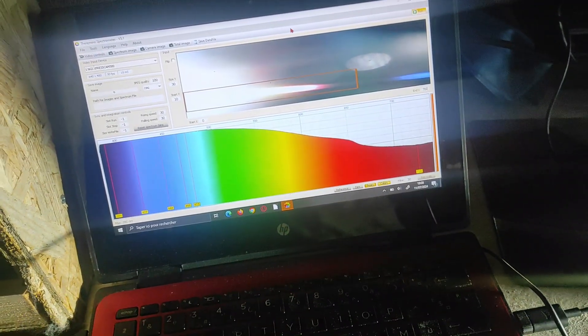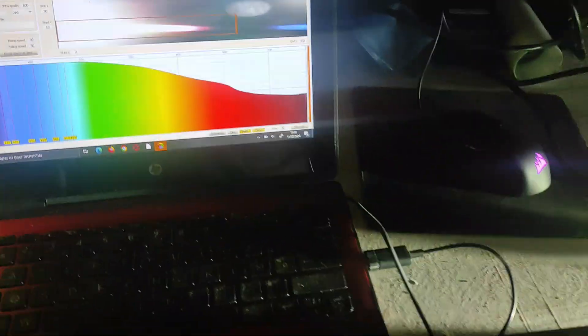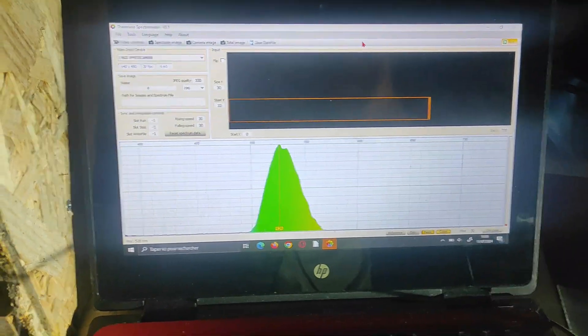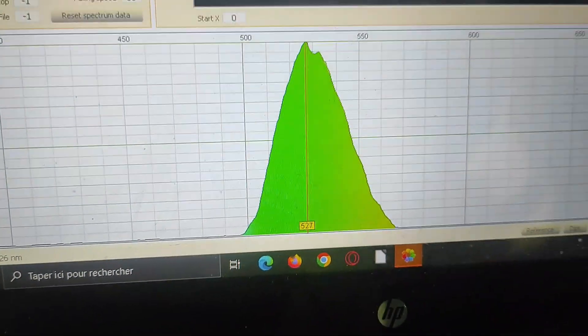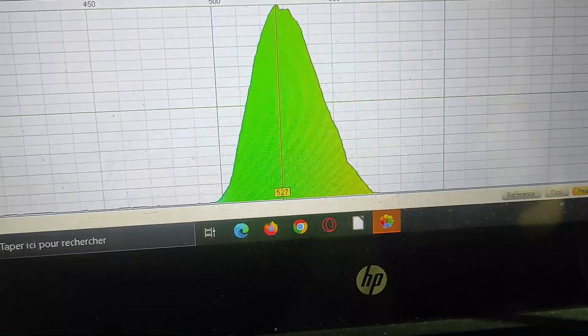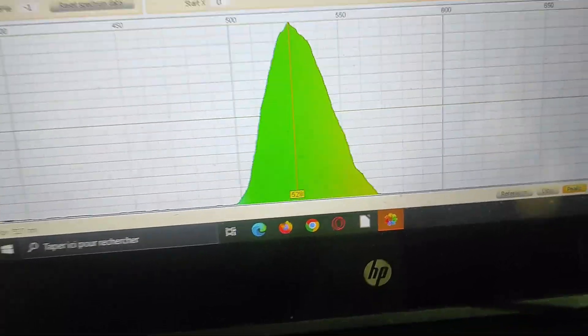Alright, now let's first test the wavelength of the chlorophyll solution. To do that, I use a very bright LED to get a good continuous spectrum. Ideally, we could also use a tungsten lamp. Then we put the tube just after the slit in the spectrometer to avoid the fact that our test tube is round, so if it's too close to the detector, the spectrum will be way less accurate.